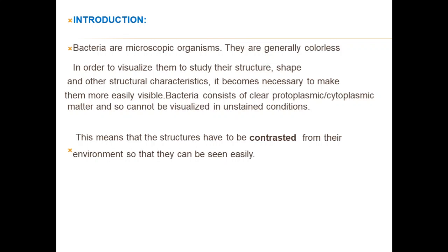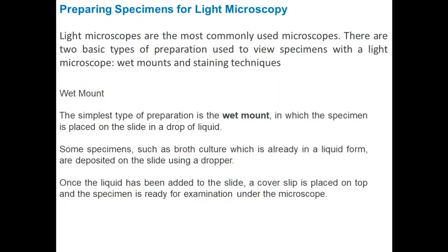So when we talk about preparing specimens in light microscopy, we can prepare specimens in two basic types. The first important type is called a wet mount and the second one is staining techniques. So what is a wet mount technique?